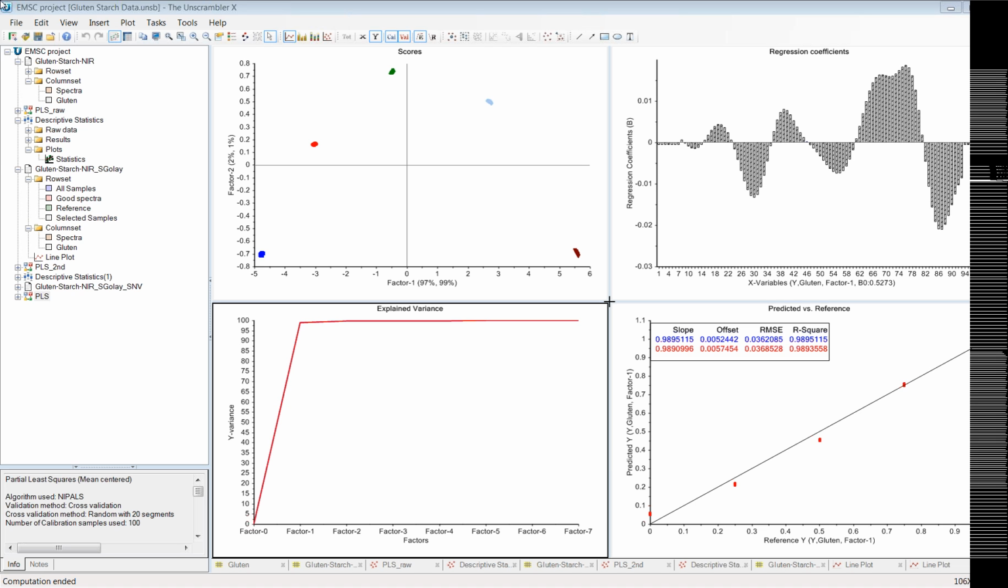In a spectra like LIBS, where 9 to 10 elements are present in the spectra for emission spectroscopy, how to select the pretreatment? Again, you want to look at your data. I don't have a lot of experience in LIBS spectra, I'll tell you that now, but again, you look at those scattering effects, look at how things are changing.